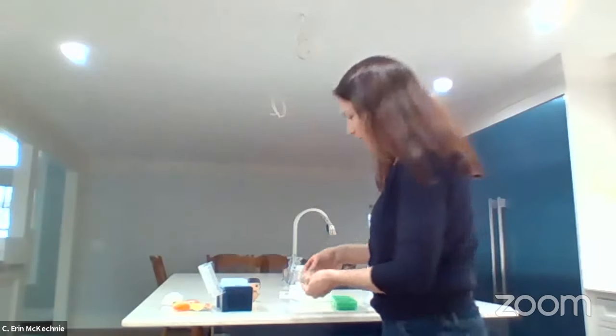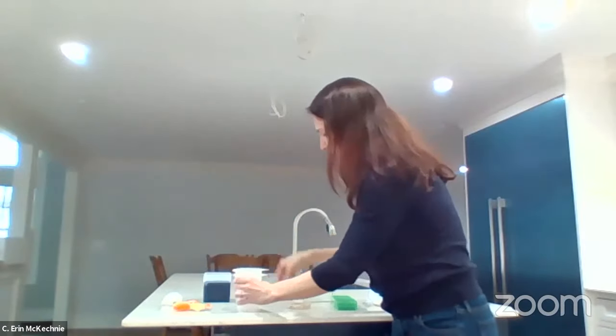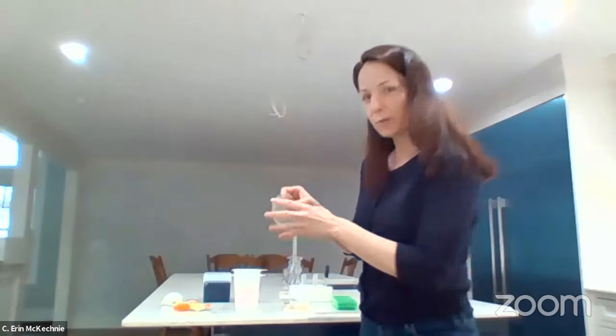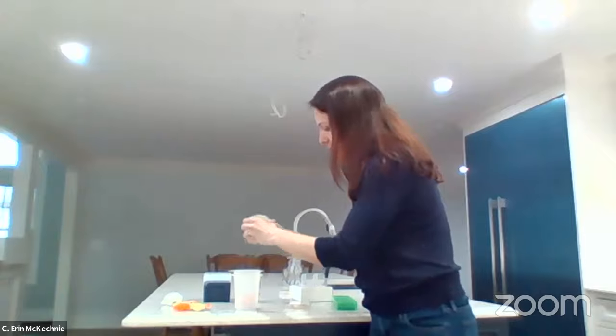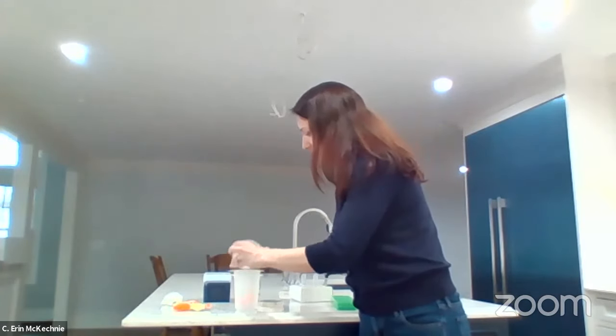Normally I would do this for about a minute, but I'll pretend that I did that for a minute so you don't have to watch, okay? Next, I'm going to take those beads out because again, the purpose of the beads was just to move the bacteria across the plate. So each of those plates should now have the bacteria just spread evenly across the surface.